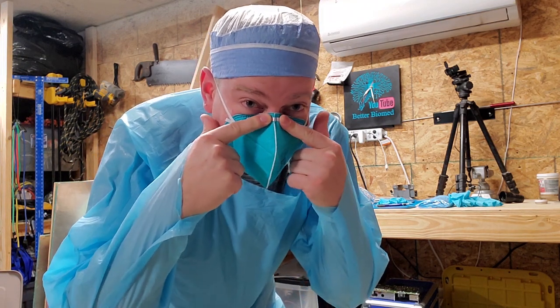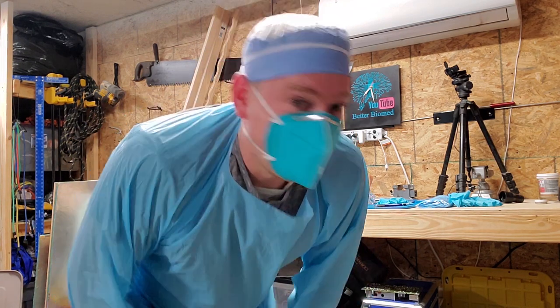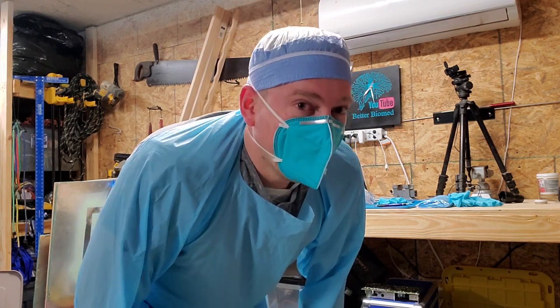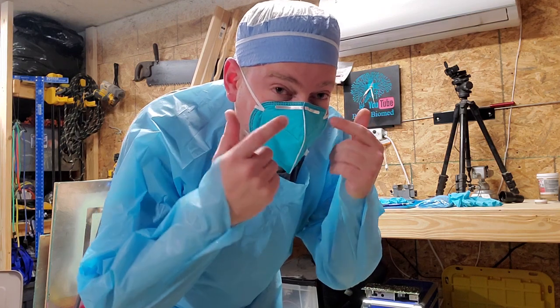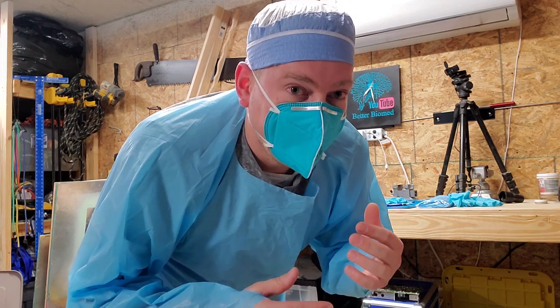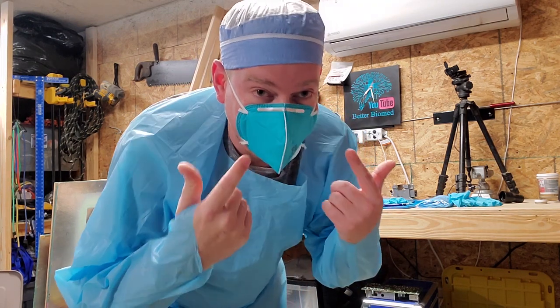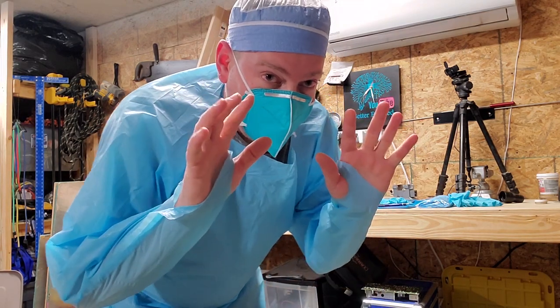Now you're going to start at the crest of the nose and you're going to bend the metal strip to shape it to your face. Now, as I said, this type of mask right here, this one's got a pretty good seal. But what you want to do is when the mask is on, you want to breathe in and out pretty heavily and see if you got any air leaking out. You'll feel it trickle out, especially up here towards your eyeballs. So make sure that you readjust your mask before you proceed. So I definitely have nothing leaking out down around here. This is a very tight fitting mask down here. I usually have problems right here around the nose. So I'll have to adjust it a few times before I proceed with the next part, which is putting on the eyewear and the gloves.